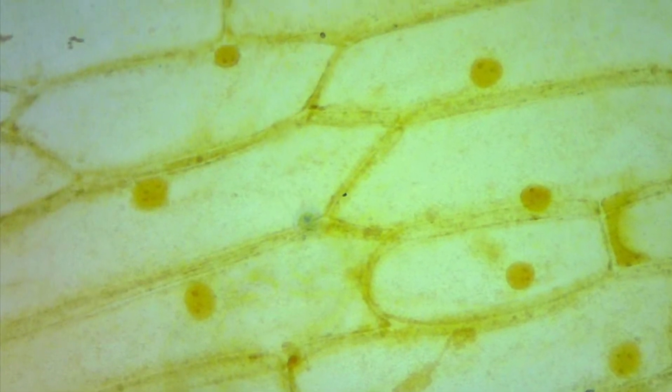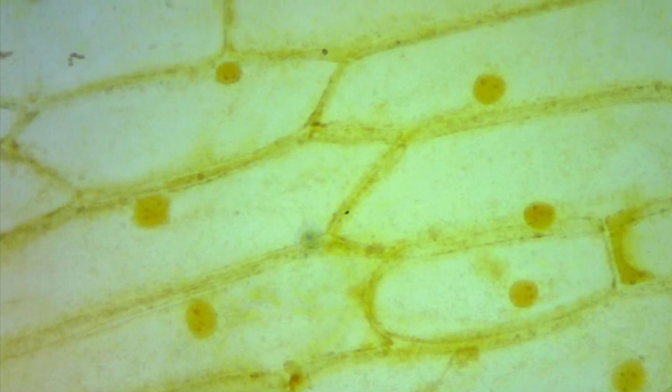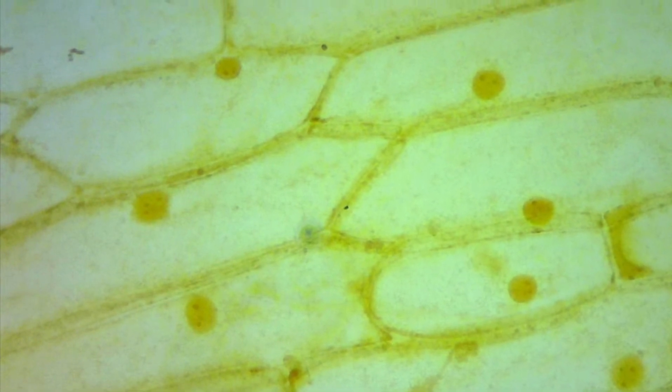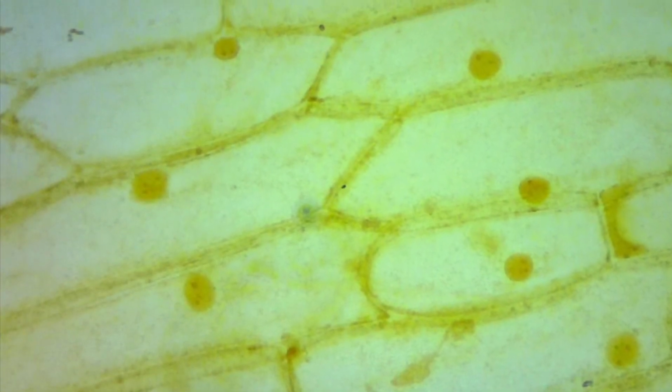The plant cell has a large vacuole, while the animal cell has a small vacuole. Both have nuclei, but the human cell has it in the middle of the cell because of the small vacuole. Finally, the plant has chloroplasts, while animal cells do not. They cannot make their own food.